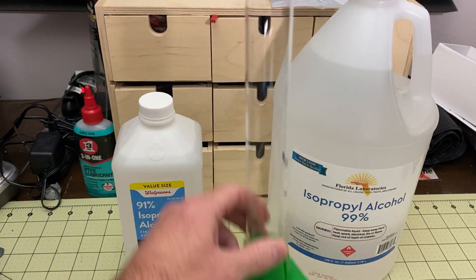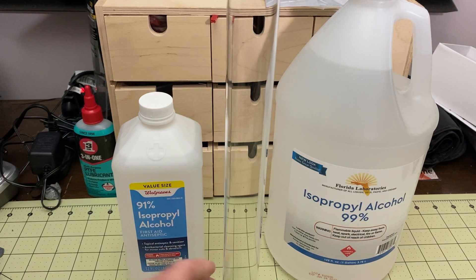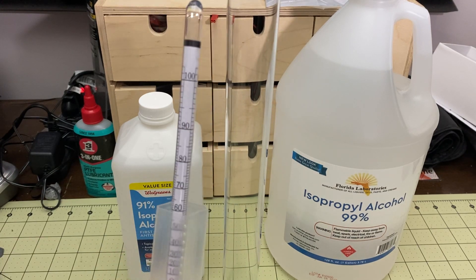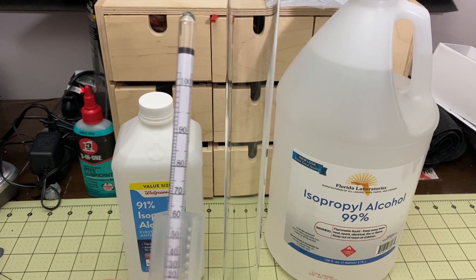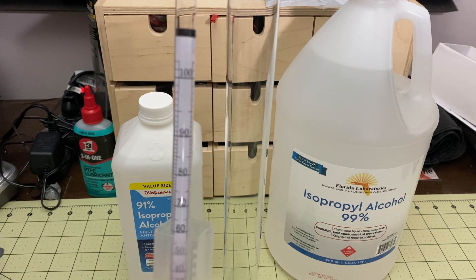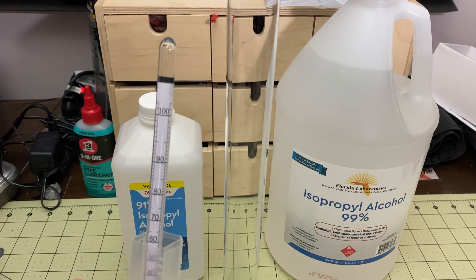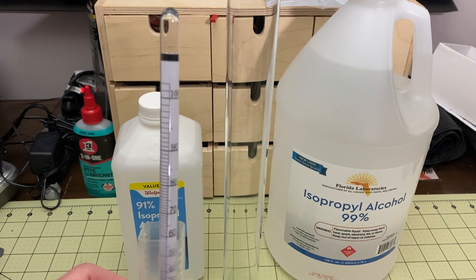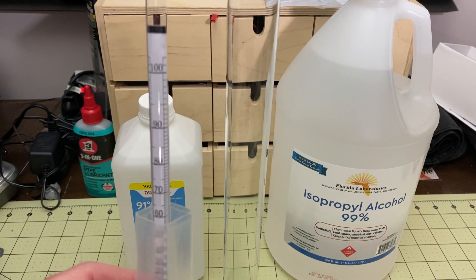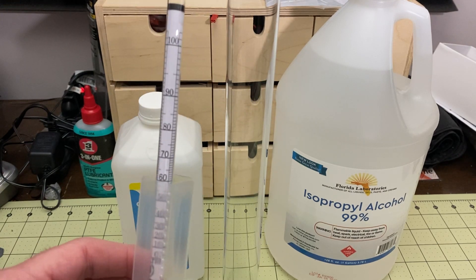This is a hydrometer — it tests the alcohol content of your liquids. This one is specifically for distilled alcohol. If you make beer or wine you may have one of these, but those are different and won't work for this test. This one was cheap; there's a link for it down below along with all the other stuff.